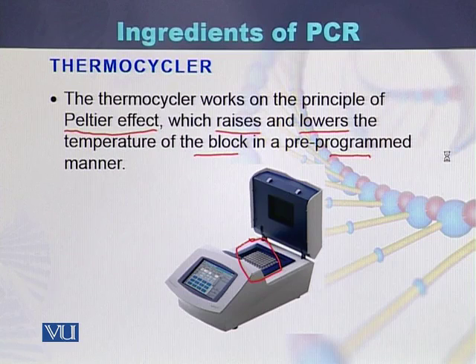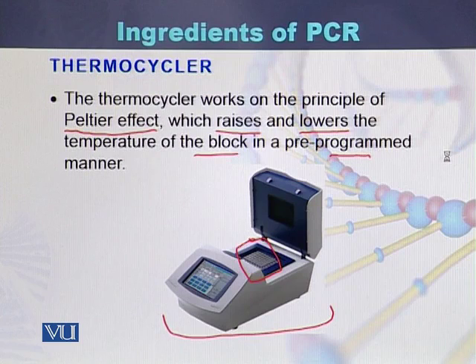So this is a typical thermocycler that we have seen here. There are different commercial companies that manufacture such machines, which are called thermocyclers.